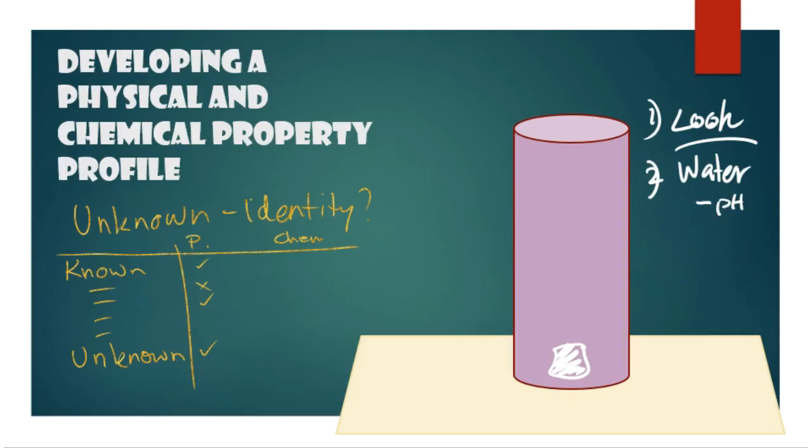So you're going to put some water in there, cover it, give it a little bit of a careful shake, let it dissolve maybe, and once you've got that little solution there, if you have one, you're then going to check its pH, check a few other things, and do some more ticks and flicks on your sheet to record down its characteristics.